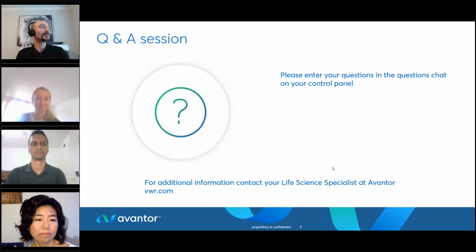Sarah, this question goes to you. Is the accuracy high enough to identify SNPs via nanopore in case of a 10 kb plasmid, for example? Yeah, so it should be. As mentioned before, if you want to look for SNPs, the only way to do that via the workflow is if you supply an insert reference, which will then be used to create a VCF report. And yeah, it should be good enough to do that.